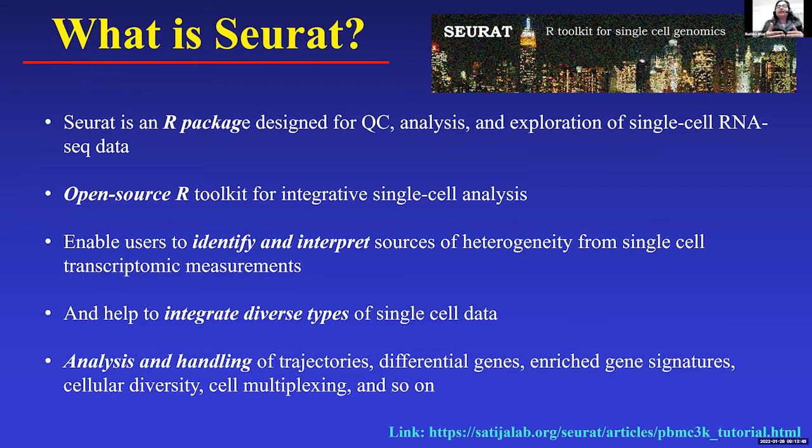Then it also helps in doing, as I mentioned, the multi-modal functionalities of single cell, where you can analyze the spatial arrangements, and you can do the trajectory analysis to see which cell cycle they are in and how they differentiate. Everything can be done on one platform.